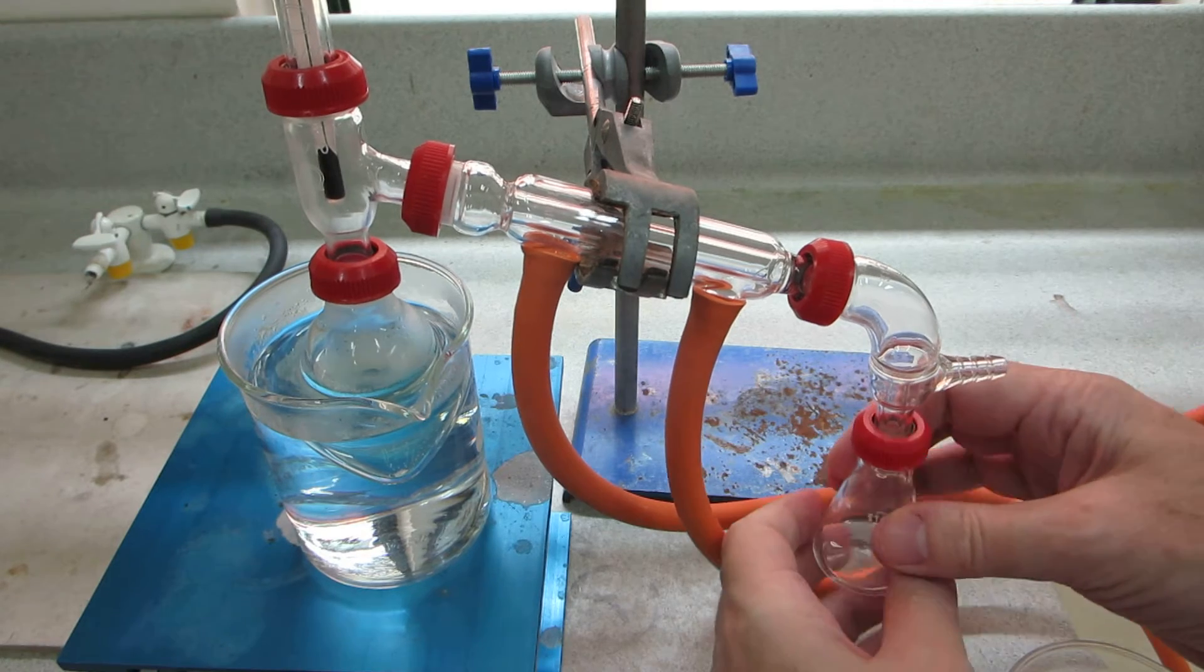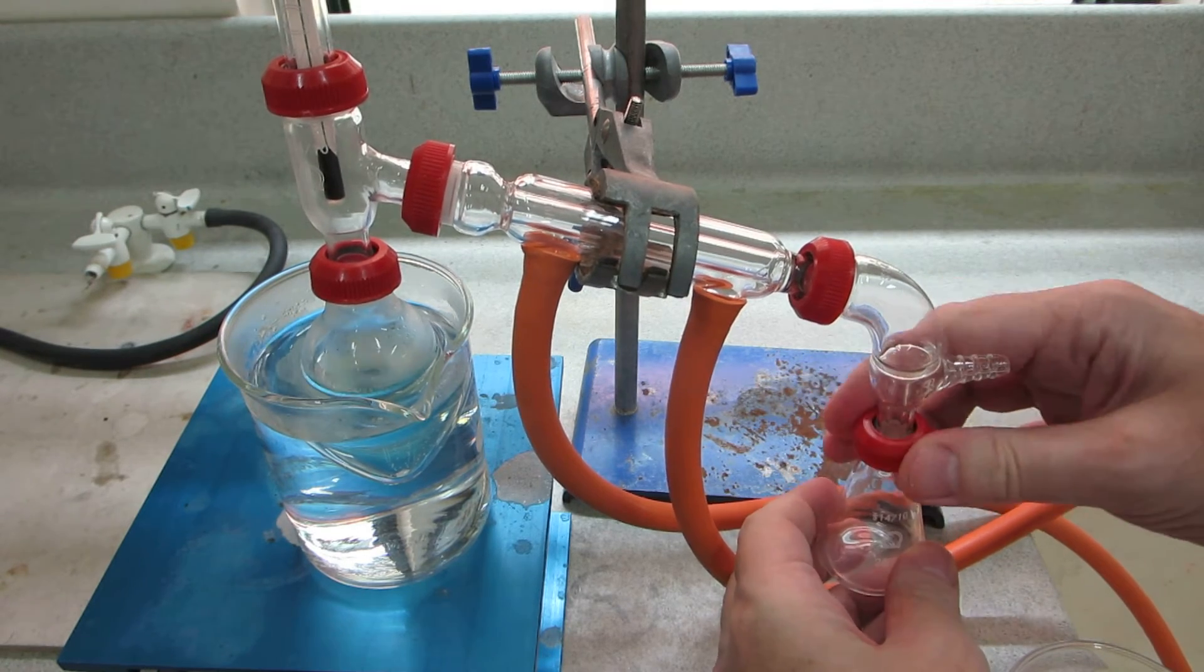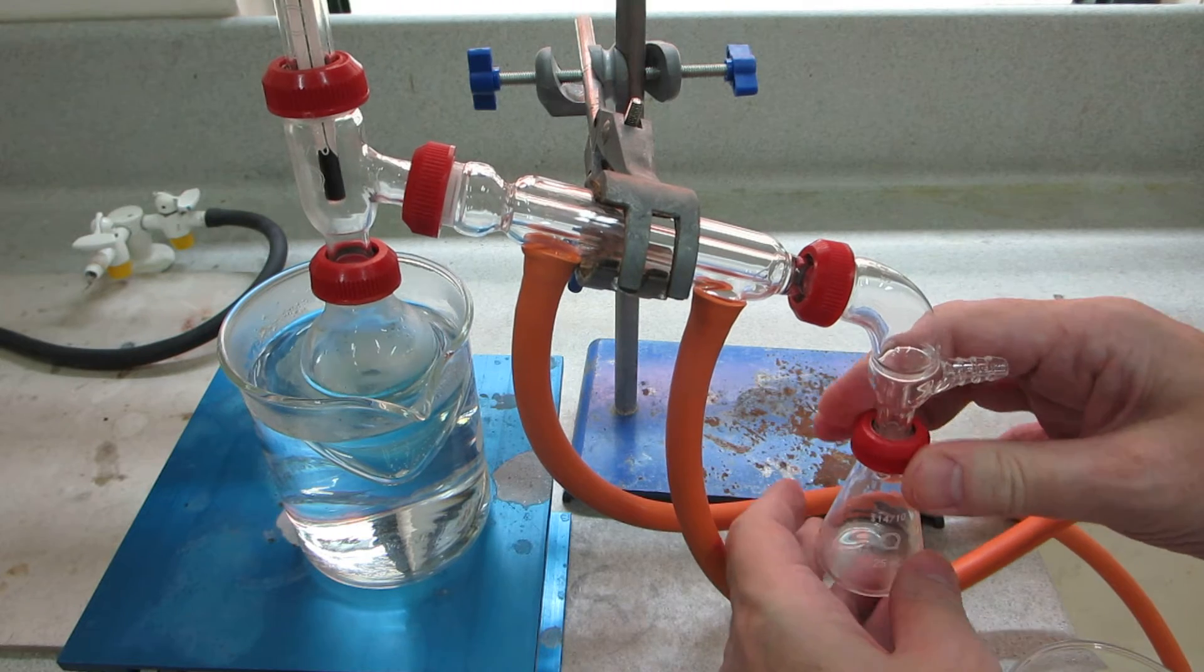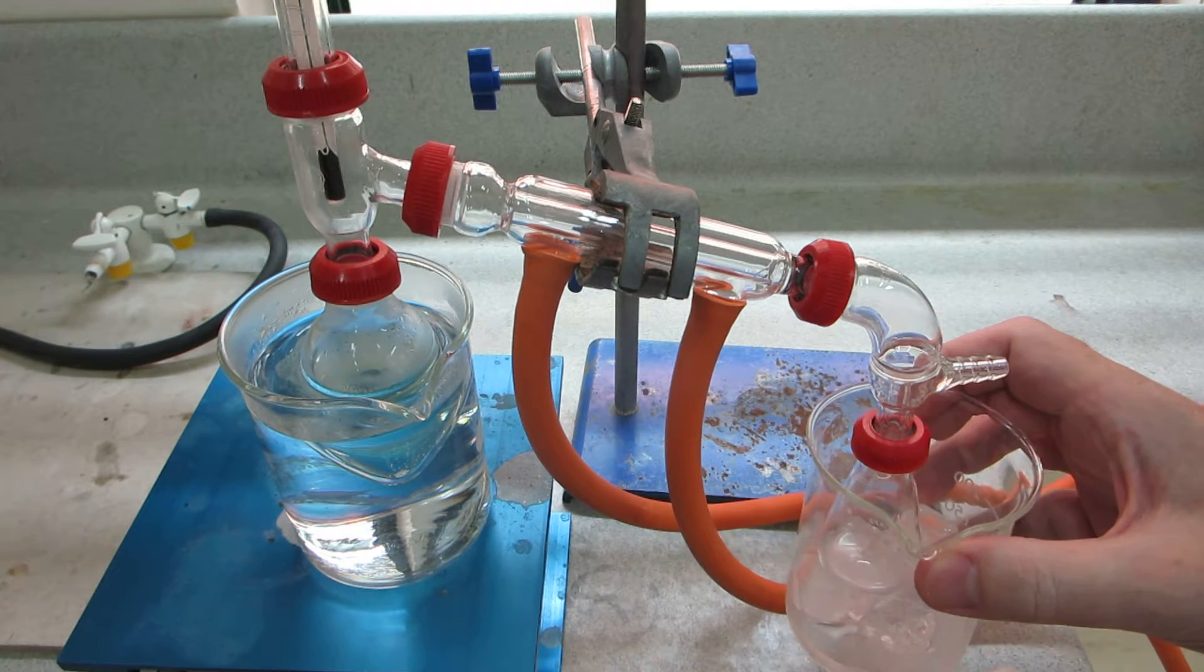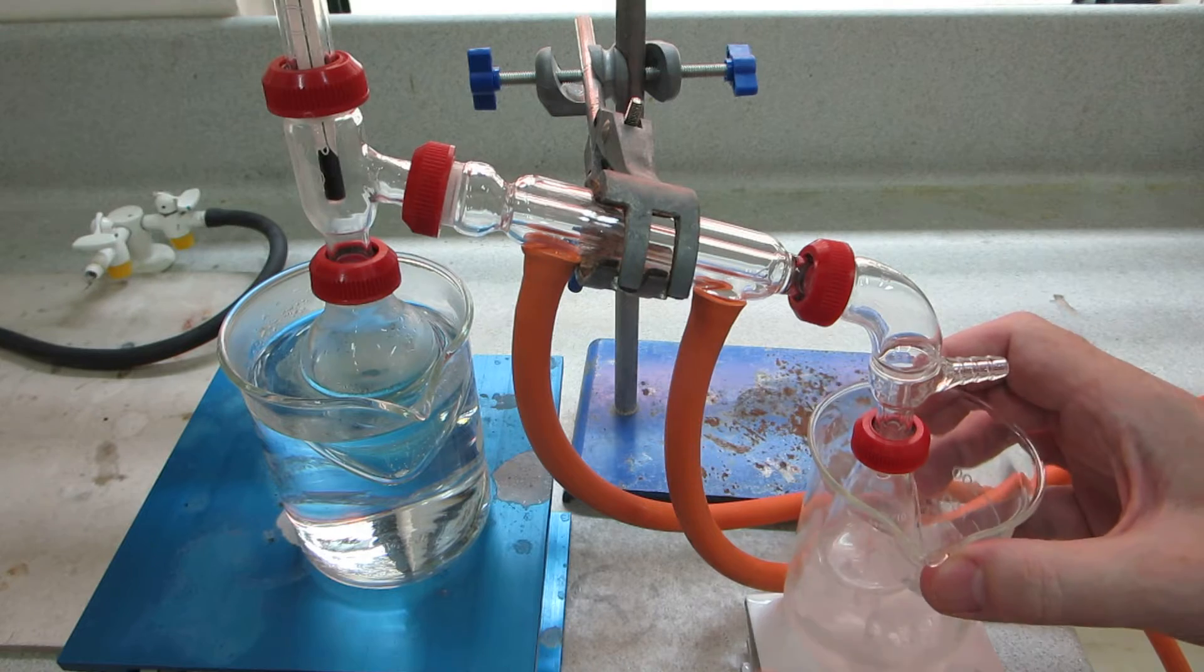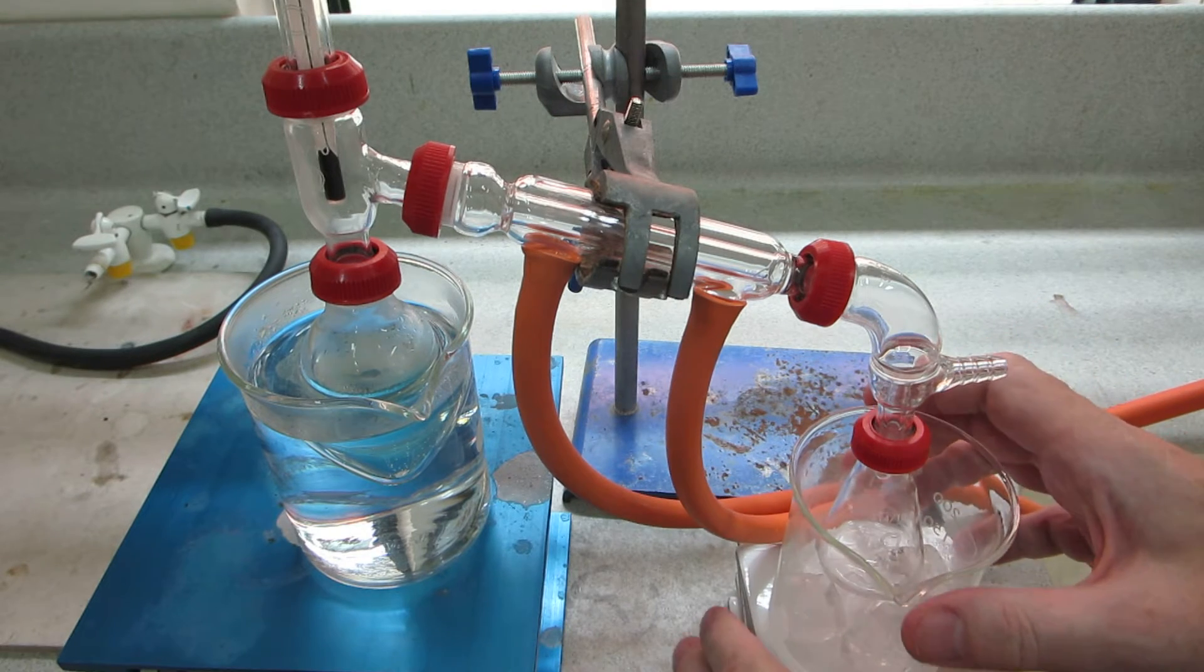So, if we attach the conical flask to the distillation apparatus, we're going to take this, and then surround with ice.